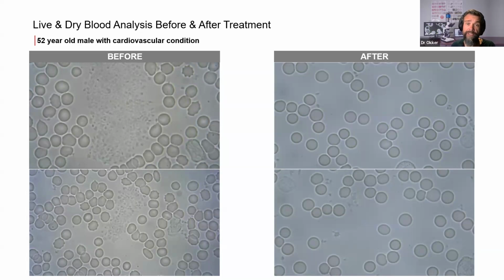So quite worrying to see this in this type of client, and something that we really then focus on in terms of treatment as well. So we can see on the right-hand side how this pattern is cleared up very, very nicely.